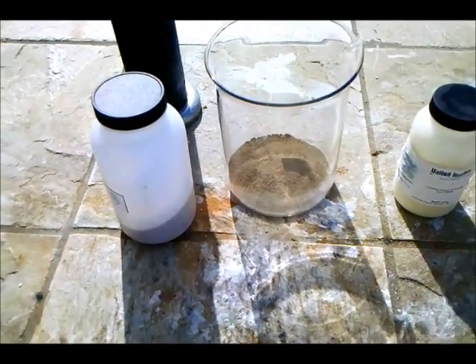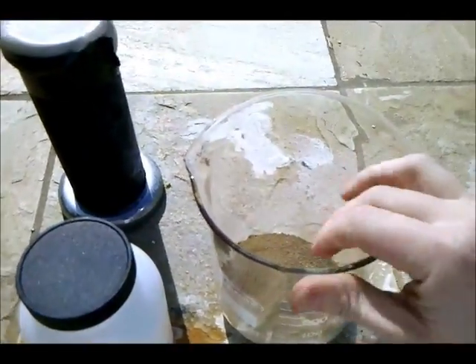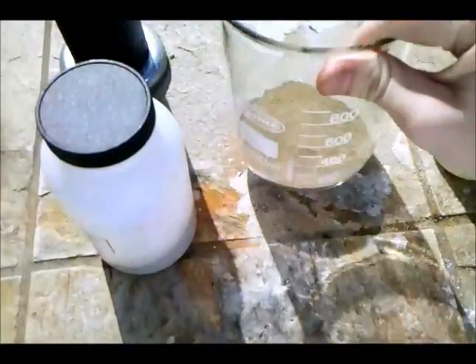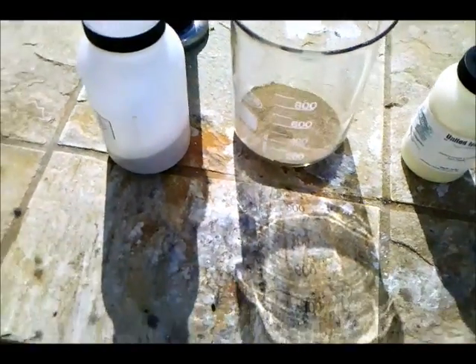Hey, everyone! In this video, I'm going to be isolating elemental silicon. My source of silicon is silicon dioxide, which is sand. And the reaction is an aluminothermic reaction, which is a thermite-type reaction.